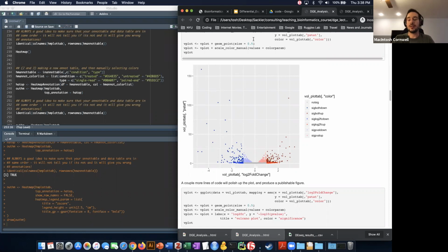But there's a whole other set of analysis called actual gene set enrichment analysis. That is a test that uses a specific metric of some sort to rank your genes and then perform an enrichment test of some sort. It's a little more complicated than that, so I'm not going to get into the details. What I am going to do is show you a basic way to do your own gene set enrichment analysis. So if you're ever given a list of genes, you'll know something you can do to figure out what those genes actually do.